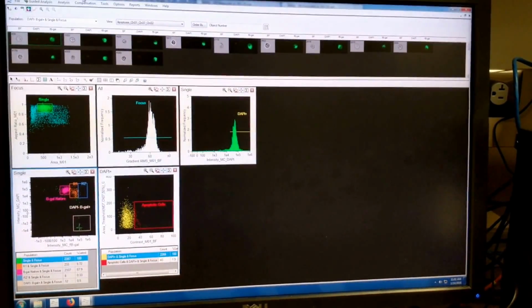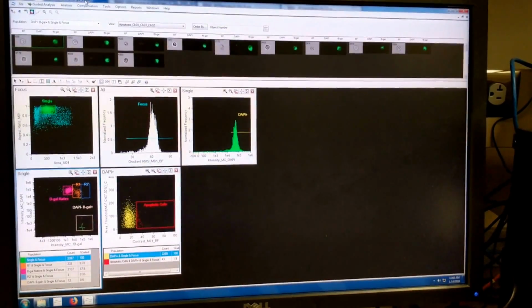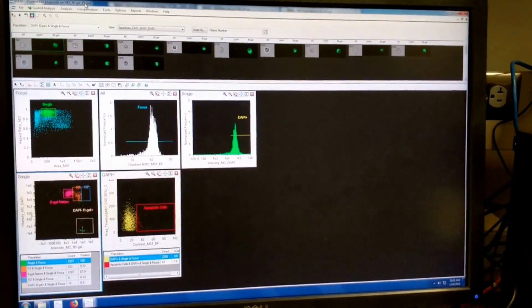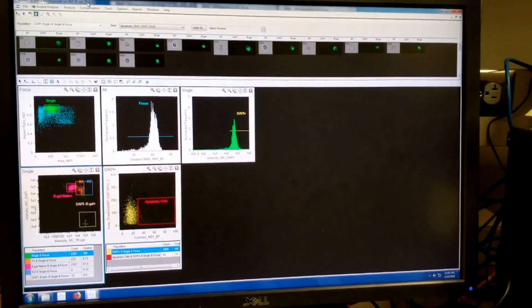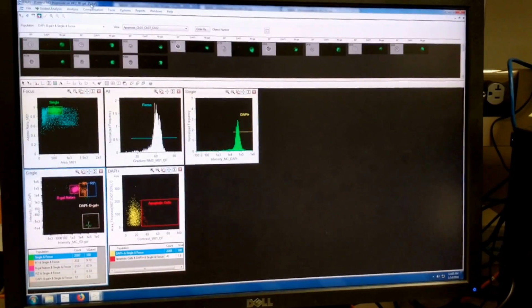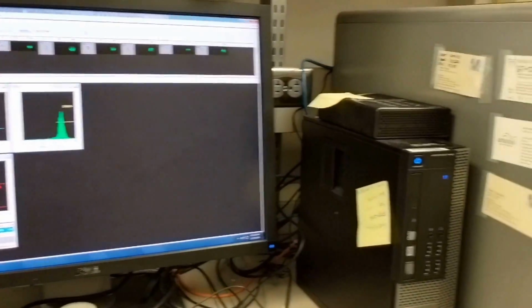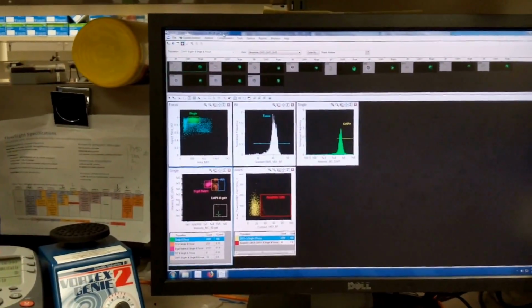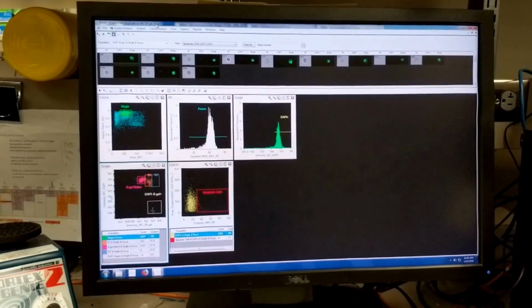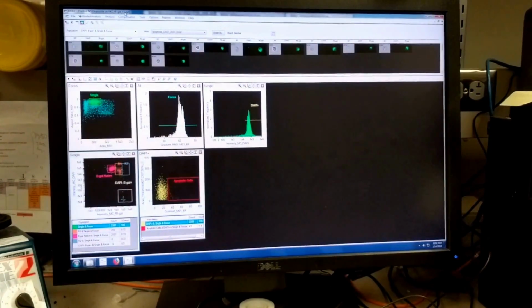experiment. So the aim of this experiment is to find out if we can induce senescence in HK2 cell lines using etoposide. And I apologize, there is a lot of background noise. I'm sitting on a flow site computer, and no one around me, but there is a lot of background noise coming from the freezers. So let's hope I can record the way I analyze the data.